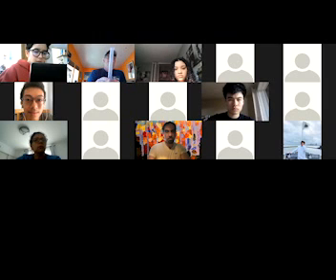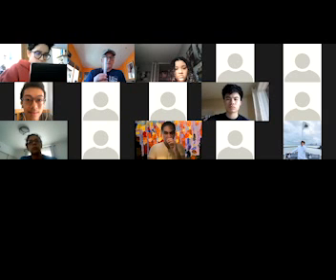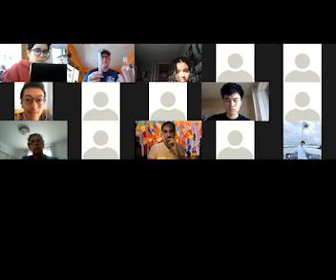what is this? Can anyone tell me what this is? Graduated cylinder? Yeah, it's a graduated cylinder. It's a little graduated cylinder. It's a 10 mil graduated cylinder. So if I were to measure a volume of a liquid, what would be a more accurate way of measuring, in this or in this? The graduated cylinder? Yeah, definitely the graduated cylinder, right? For a lot of different reasons.